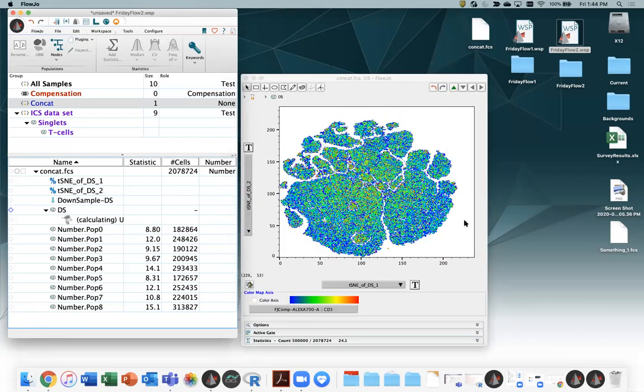All right, and we can do some comparison using t-SNE to represent the outcome of our various clustering approaches. And we can also, once UMAP wraps up, show them on UMAP. So let's see, UMAP should be finishing soon. I did feed it, what, 2 million some cells, so that's a slightly longer process there.